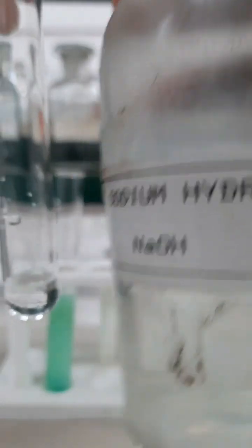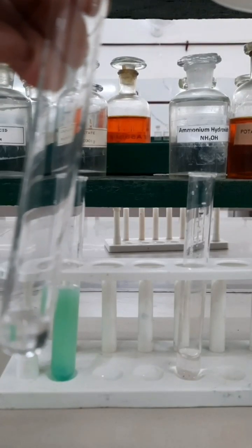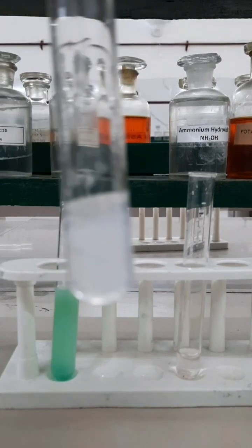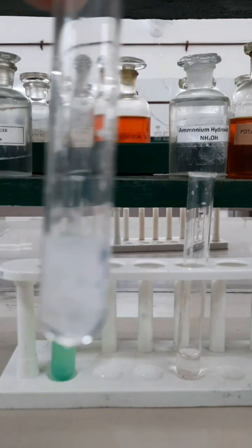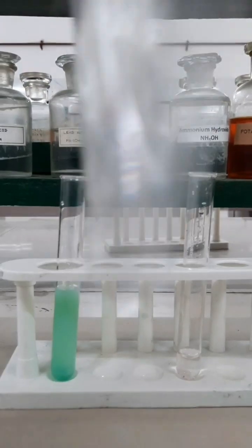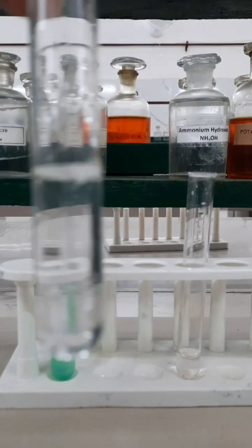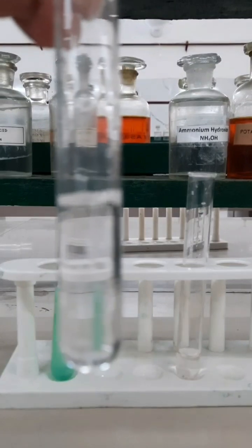After adding sodium hydroxide solution, a white precipitate of zinc hydroxide will be obtained and it will be soluble in excess of sodium hydroxide. Zinc is amphoteric in nature and it will be soluble in excess of sodium hydroxide due to the formation of sodium zincate. And a clear transparent solution will be obtained.